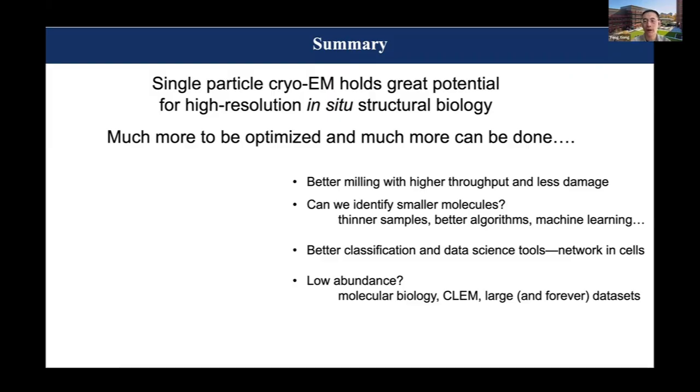So that really calls for a very good database. The entire field needs to have a good algorithm, or like EMDB, like PDB, they already started this effort to have a database for the lamellae data, so that everybody can, say, data mine it for your targeted interest. This is just some perspective.